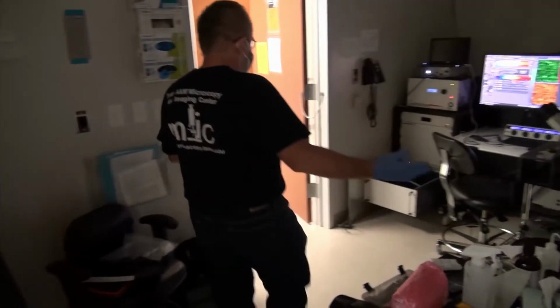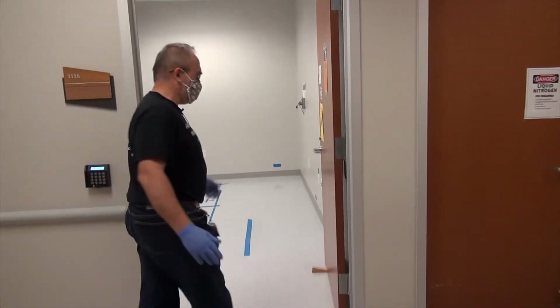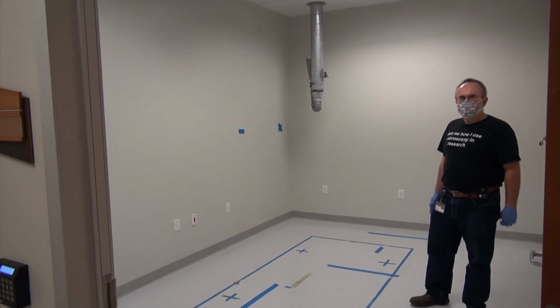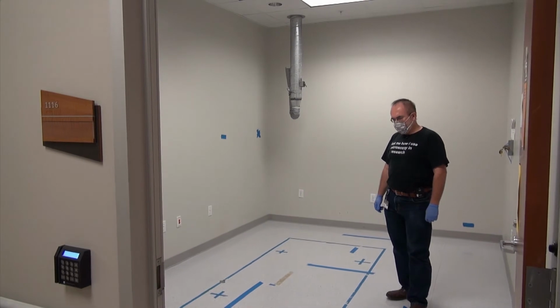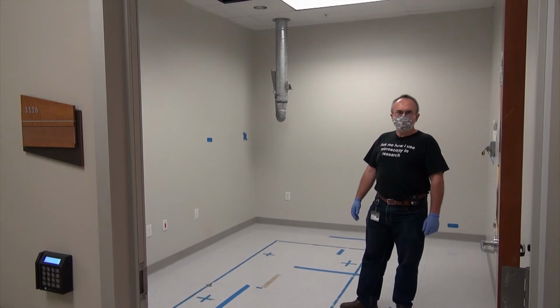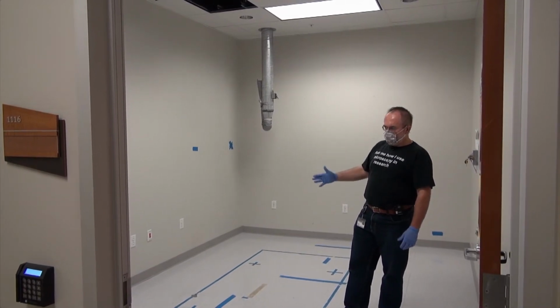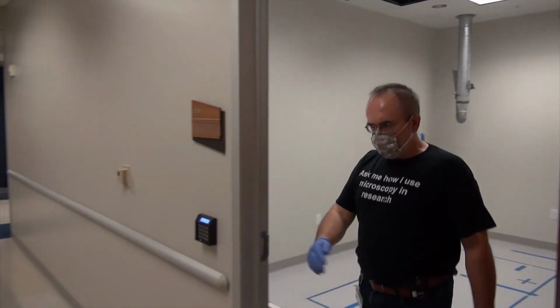So these were all the instruments that you'll see today. But in this room, by the end of the year, we will have delivery of our new instrument, the cryo scanning electron microscope with focused ion beam, the Thermo Fisher Helios 5 instrument with Leica cryotransfer accessories. Adjacent to this room will be a sample preparation room, which I'll show you next.